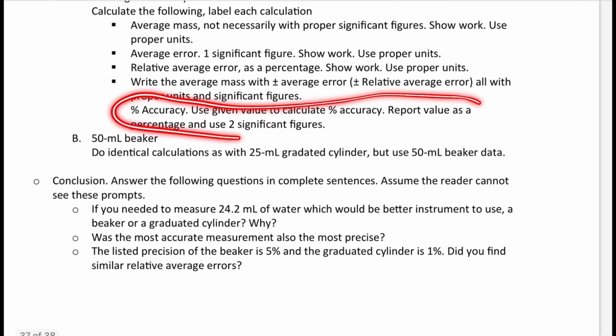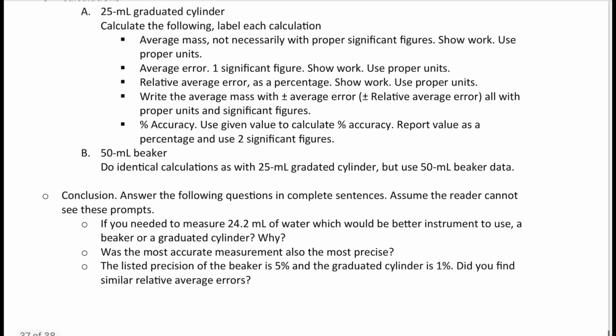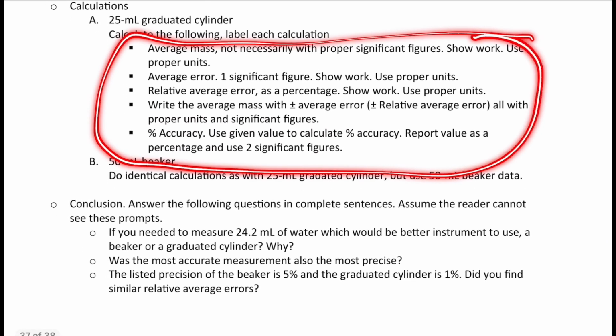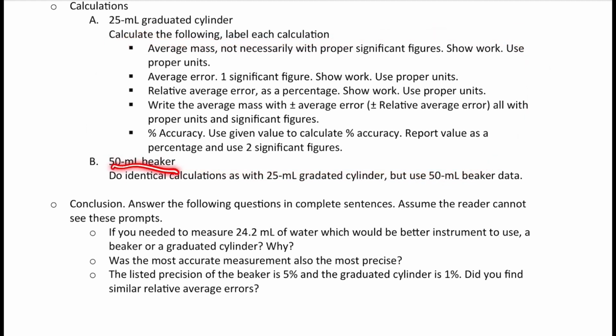And then finally, you're going to record percent accuracy. And then you're going to do this whole mess all over again, but now for the 50 ml beaker.